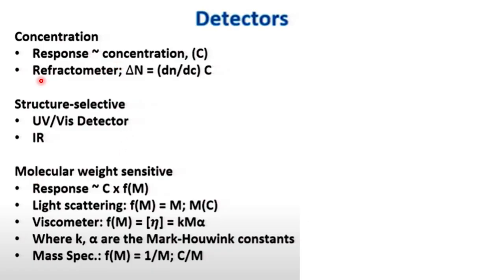Now the detector is very important in chromatography. There are different detectors based on different parameters.